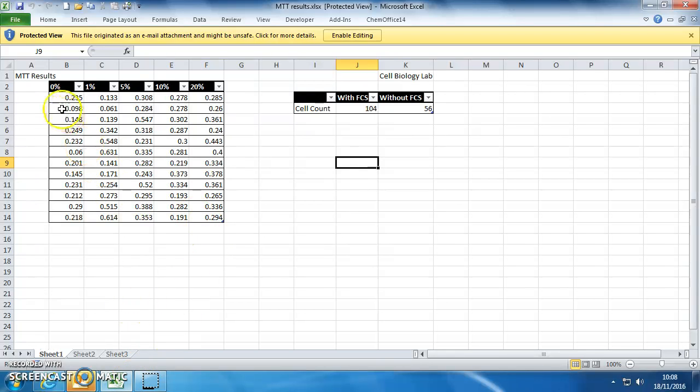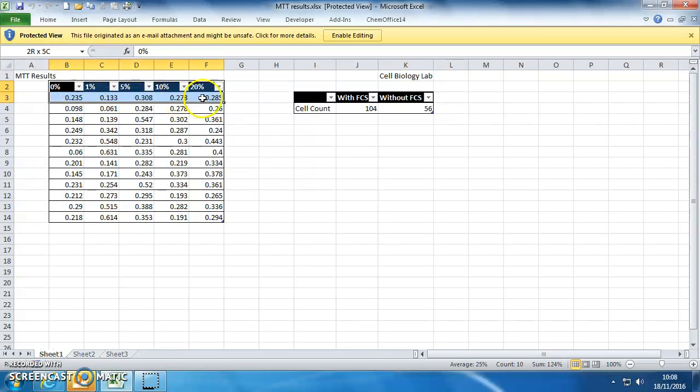This is showing how to do some analysis on MTT data for the cell biology lab. So this is all of the data in Excel.